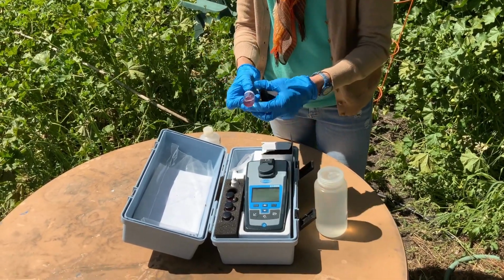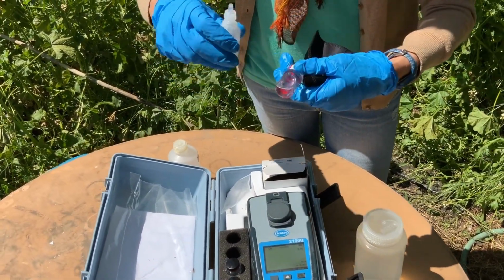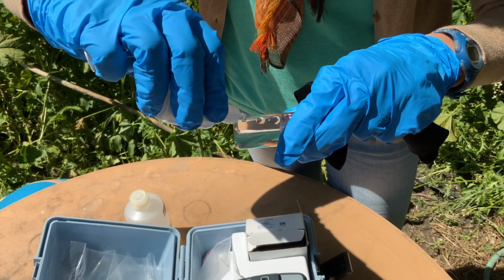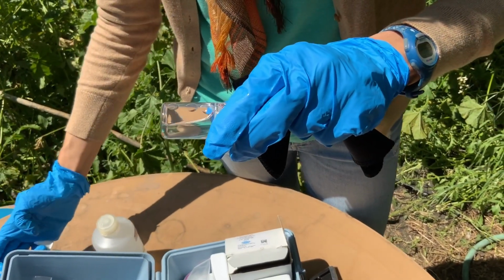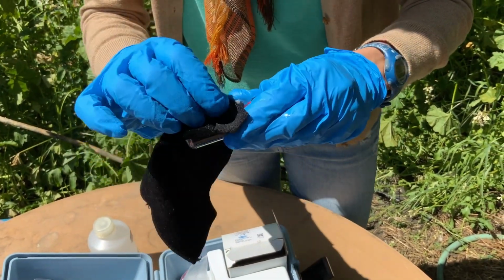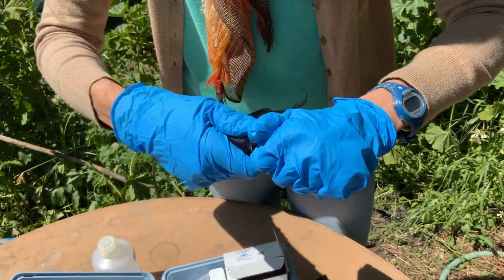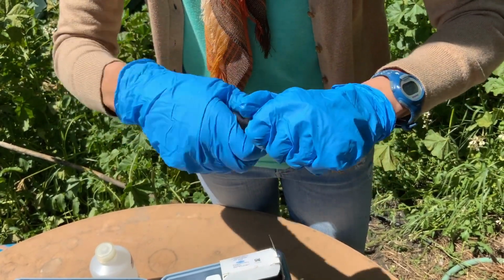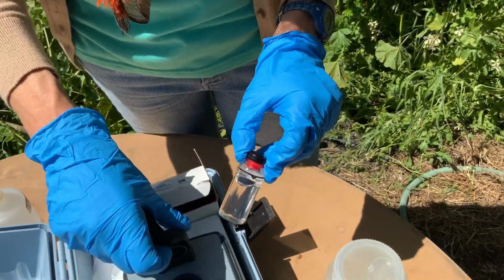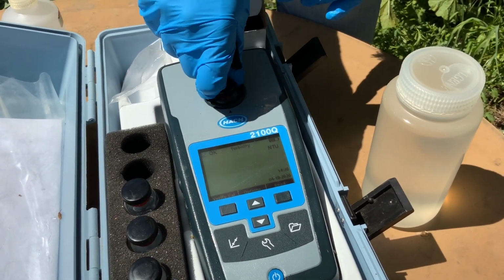So I'm going to first wipe it off a little bit, and then I'm going to put some oil on. What the oil does is it fills in any micro cracks that are in there. So just 3 drops of the oil, and then you take your little cloth that comes with the kit, and you put that oil all around your vial. Then you look for the little arrow on the vial, and you line that arrow up with the arrow on your meter. Am I in line? Come in line.